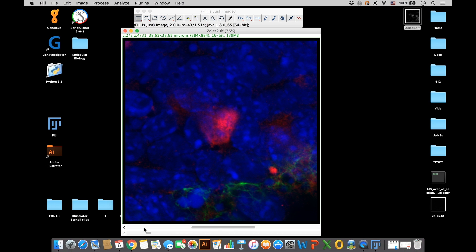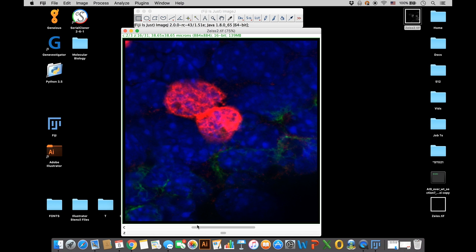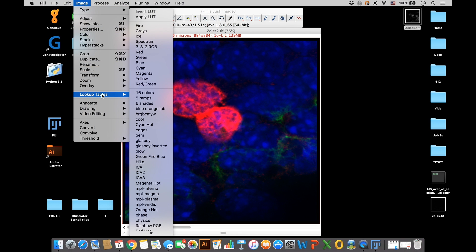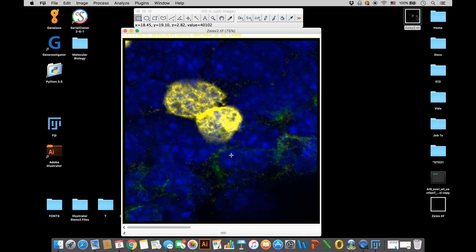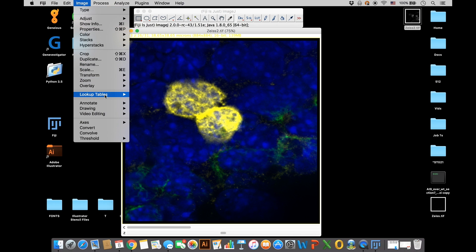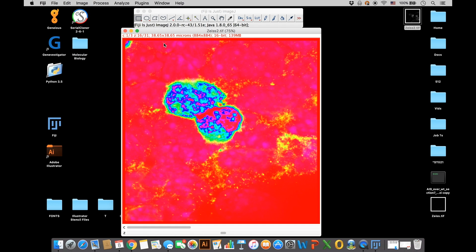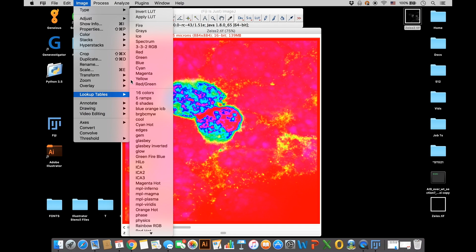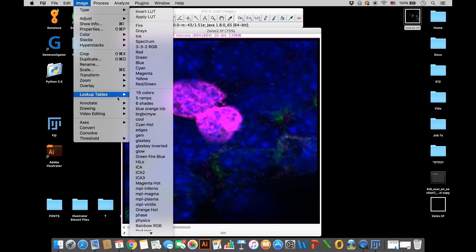I'll focus on red here and go up to Image and down to Look Up Tables. You can select whatever color you want to change it to. Here I'm showing the example of yellow, and you have multiple options. You can play around with it and see what works best for you. If you have four channels, yellow is a good option for that fourth one. Magenta is also a good option since red, blue, and green are typically the first ones taken.